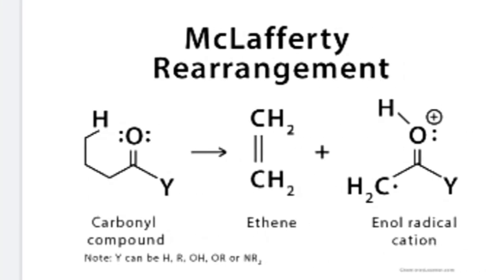This is the McLafferty rearrangement. This is a carbonyl compound.